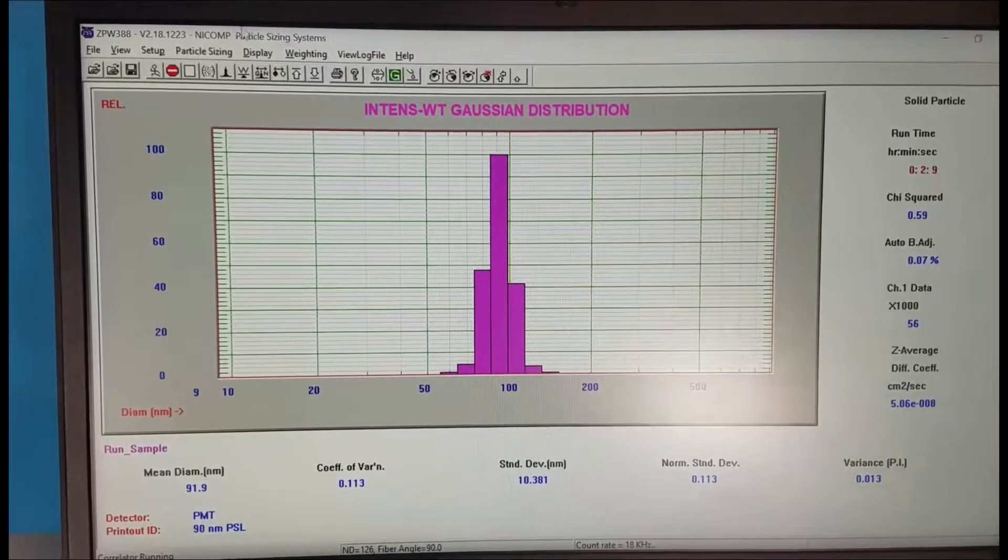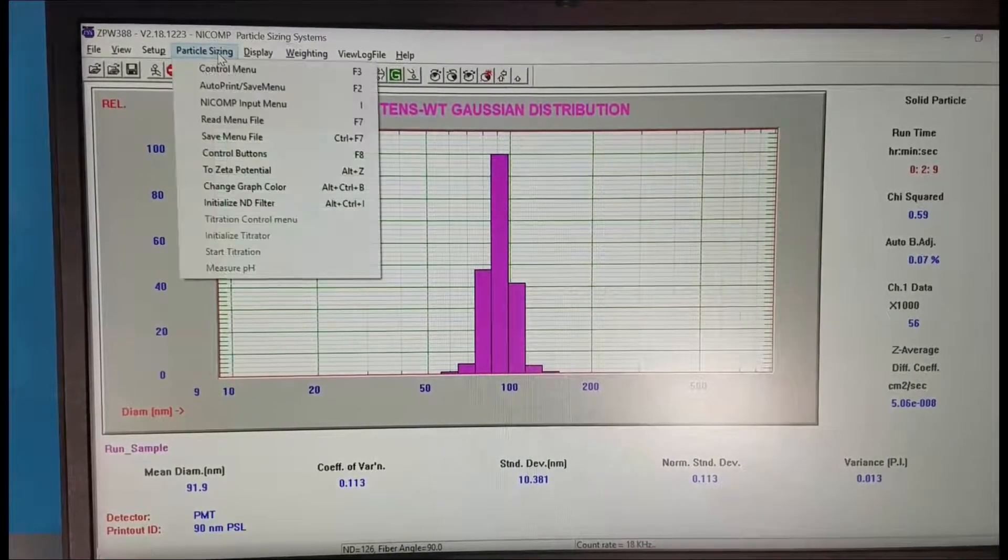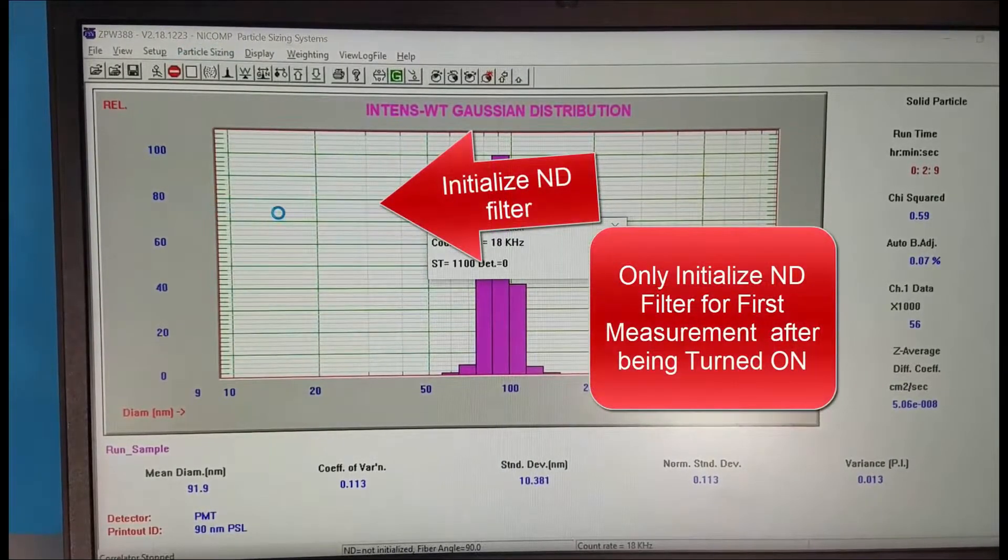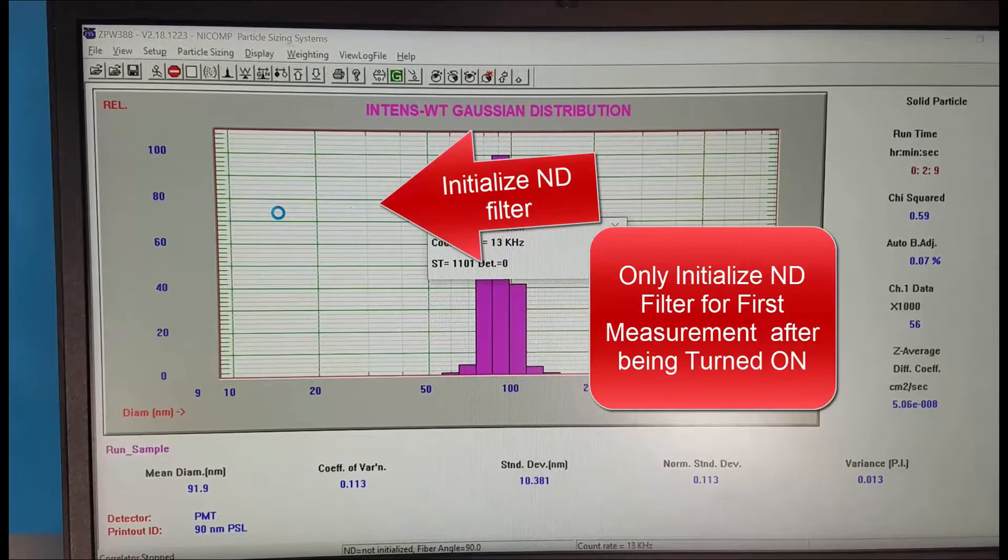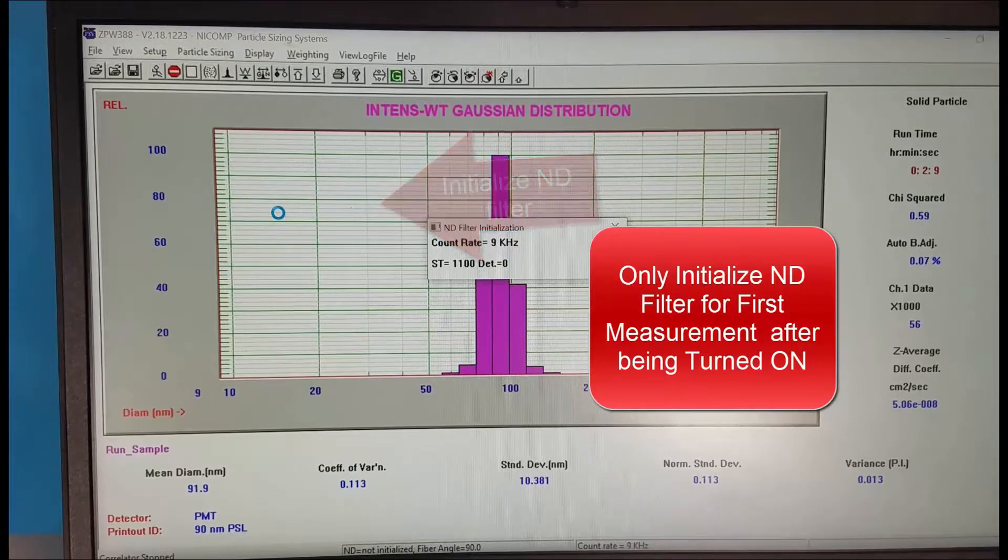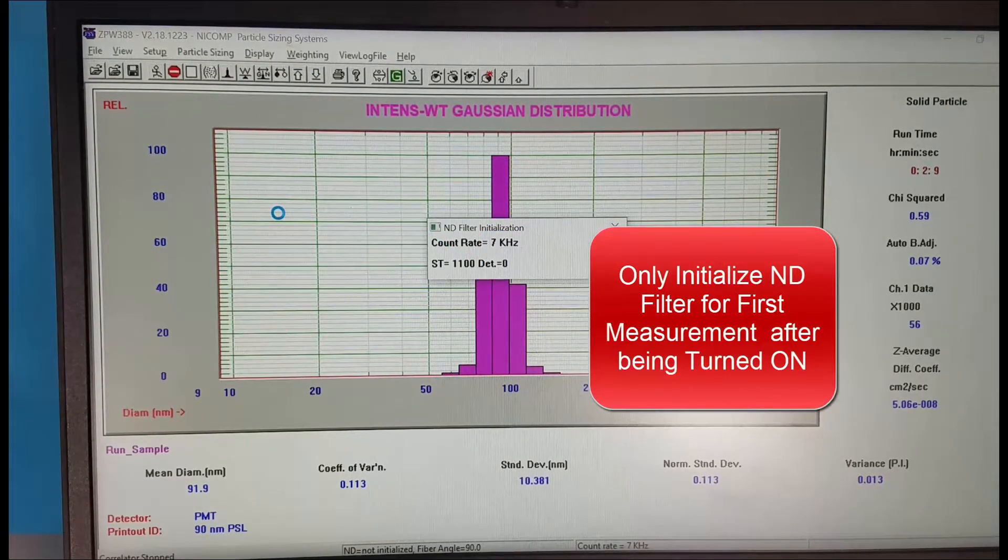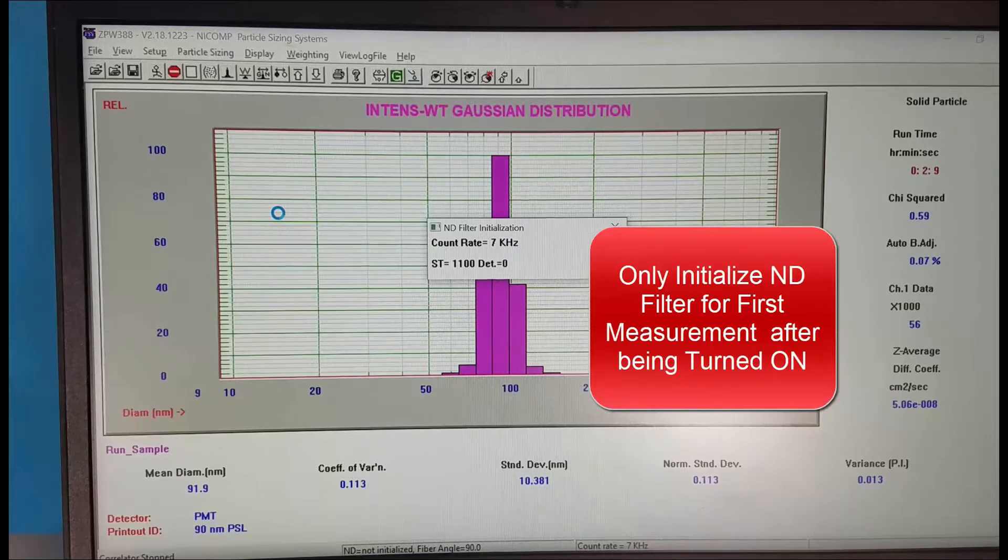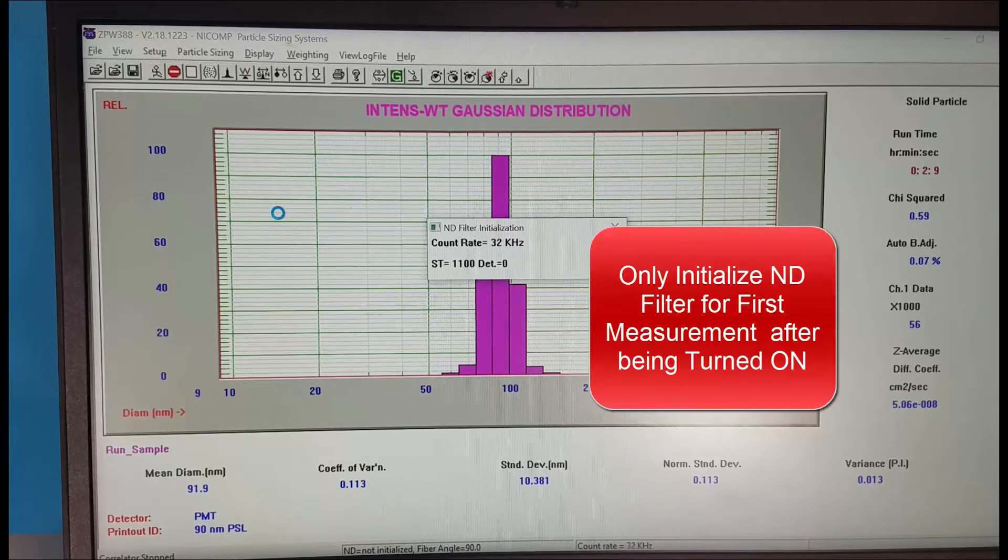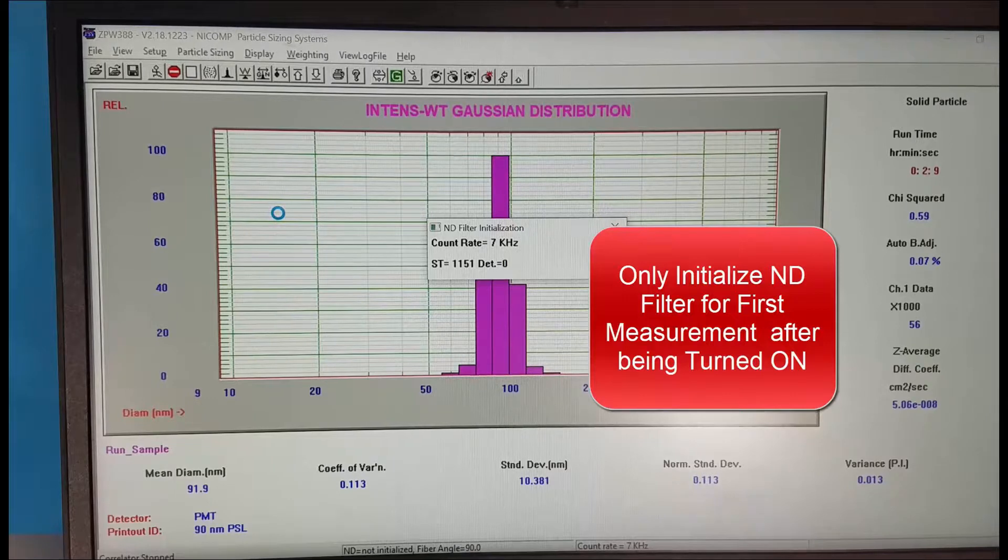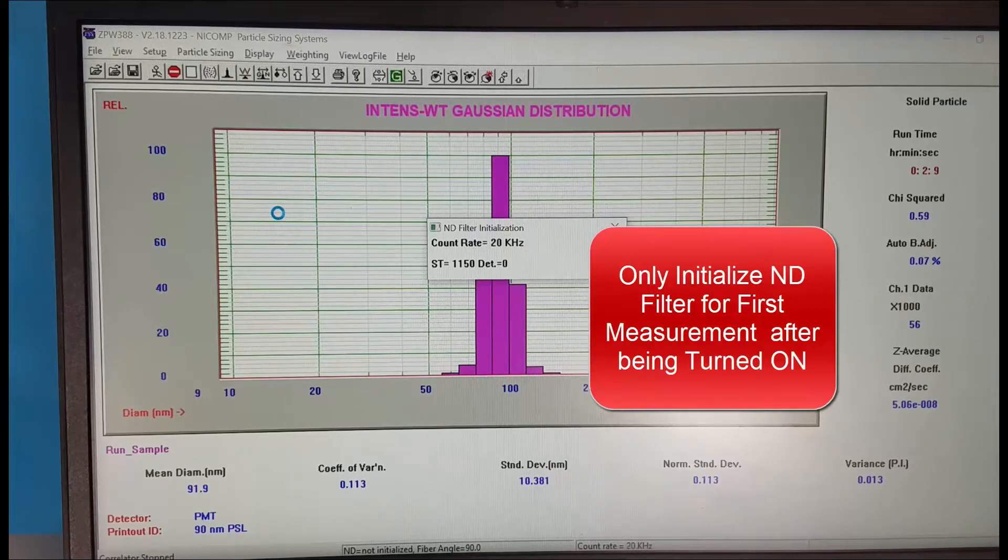In the software we're going to click on particle sizing and initialize ND or neutral density filter. Now an optical filter is rotating to optimize the particle count rate typically near 300 kilohertz. So we'll wait until it completes this initialization.